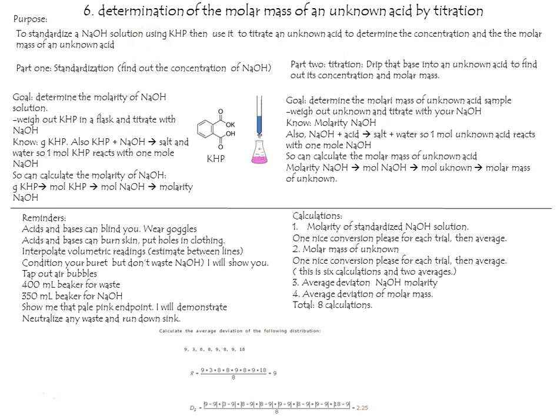You could just be given an unknown acid, you have some base whose concentration you know, and you'll add an indicator so that when the base is added to the acid, the moment it passes past neutral and goes to basic, you'll get a color change so you know when it's been neutralized. And the more base you have to add to that acid, the stronger that acid must be in a proportional sense. And for this experiment, it is a 1-to-1 mole ratio.